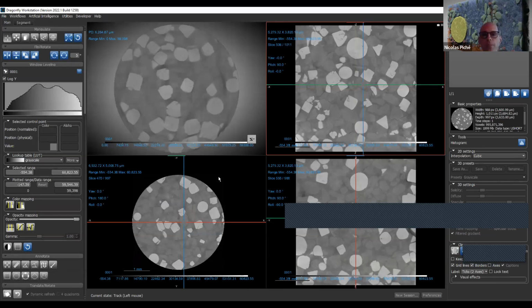Okay, so notice the current screen is the screen that is in red, or the view if you wish. The view is like a cut plane that cuts your data in space, okay? And you can have multiple data at the same time at the same place, and you will see them in fusion mode, and you can control the opacity. But I will cover that later when I do correlative stuff. But now what you need to know is that the current one is the red one.